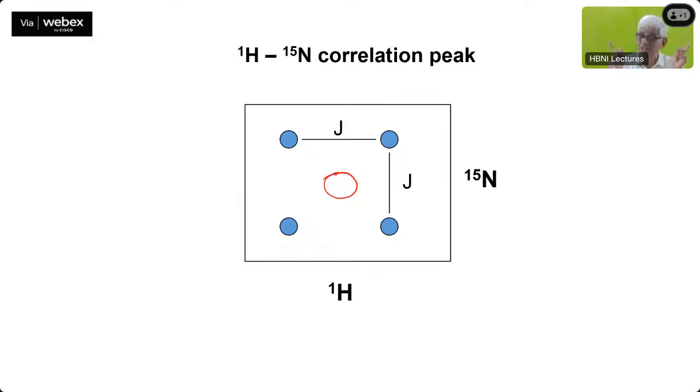You saw that in the R2 expression, which you were given yesterday. In the heteronuclear R2 expression, you have the C square, the chemical shift anisotropy contribution, and the D square was related to the dipolar coupling relaxation. And the 2 things work in opposite directions, and they tend to cancel each other. This cancellation is maximum at 1 gigahertz. So you see that 1000 megahertz, that is 1 gigahertz.